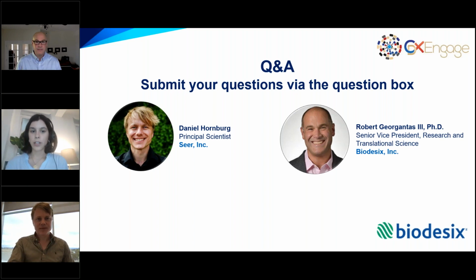Daniel, I think this one's for you. Can you confidently discriminate or quantify the mutant versus the wild type alleles of the same protein?